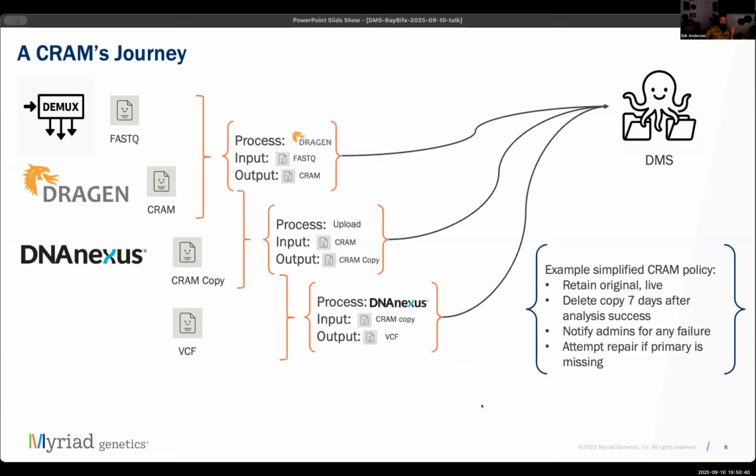Along the way, if failures or anomalies appear instead, the same event flow triggers the right policy action, perhaps to wait longer, perhaps to alert admins, perhaps to attempt repair, or some other third combination or fourth combination of all of these possibilities. This way, our policies are provided at once and the DMS enforces them consistently across workflows as they execute. As the system changes, the DMS reacts and manages along the way. And that is how the DMS thinks about data.